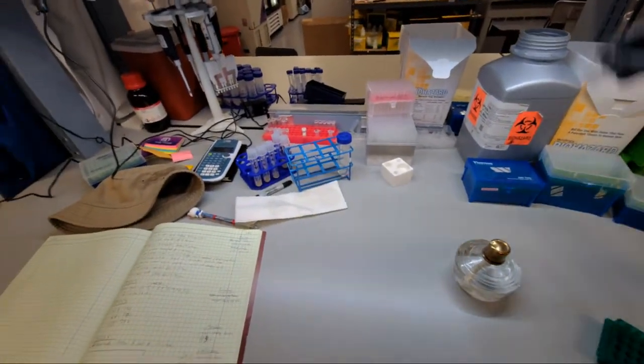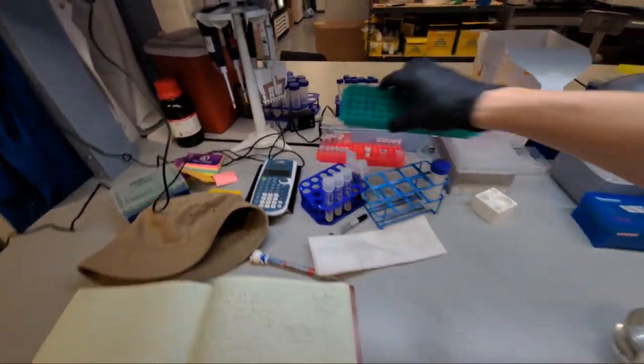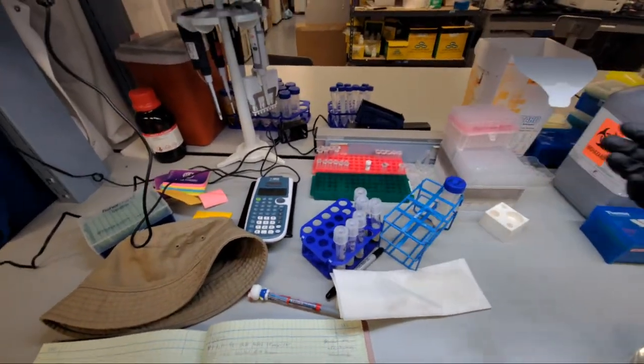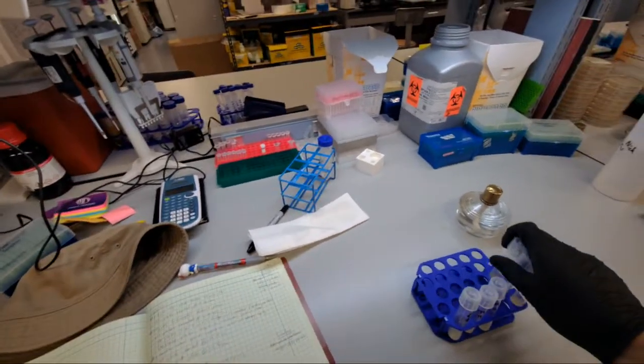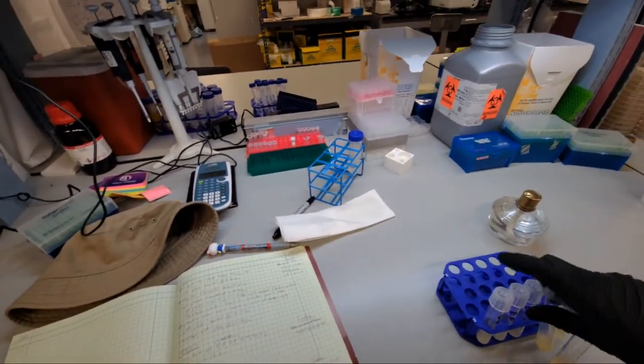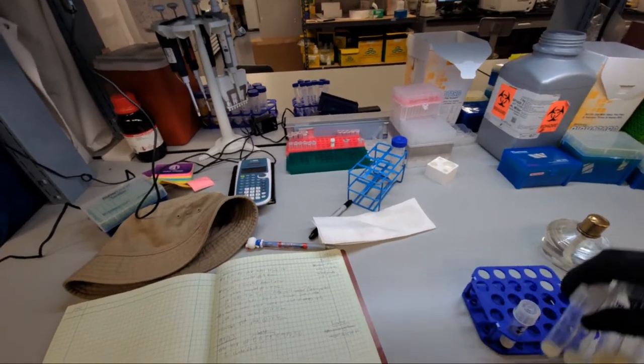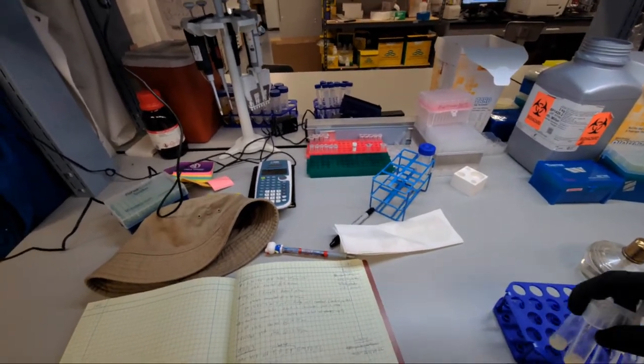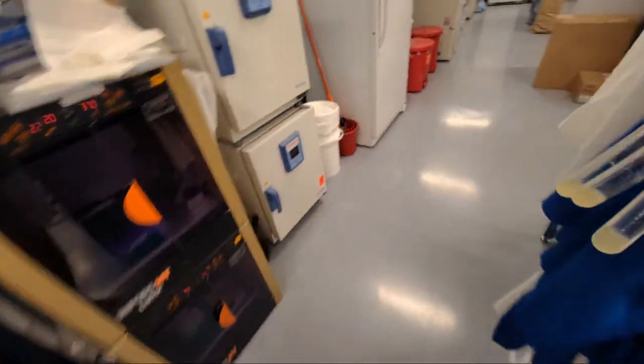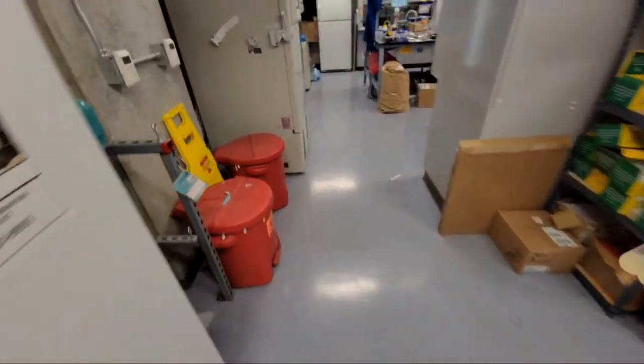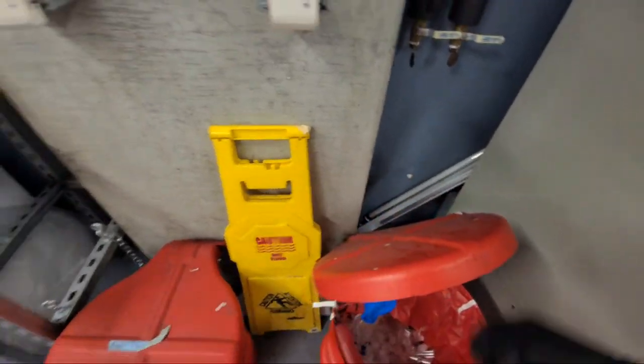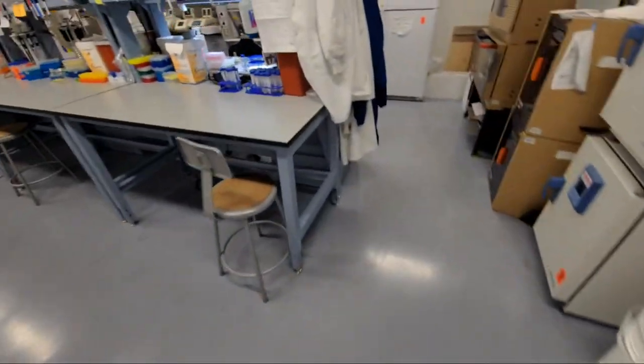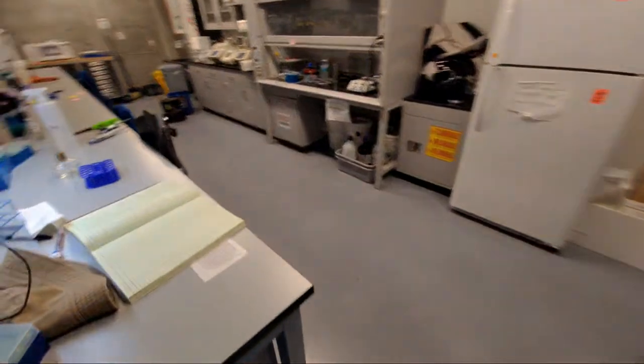So I think if you can get that down, then you can figure out how to grow algae. Again, it's a slower growing organism. So there are going to be competing molds and bacteria and whatever that can get into your culture. So your sterile technique should be even better than if you're just growing fast growing yeast or bacteria.